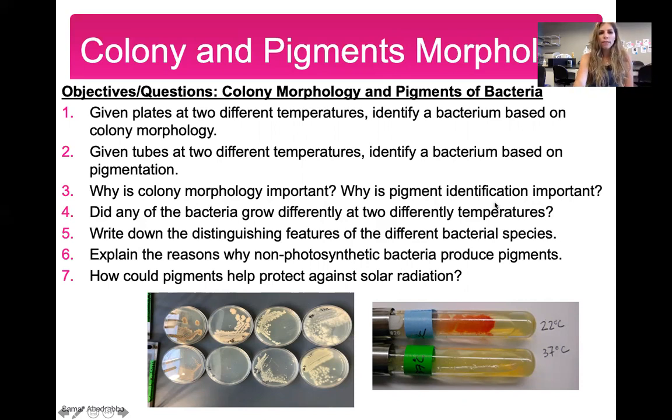So go through all of these and hopefully all of it makes sense. Know what the distinguishing features of all the bacteria we talked about are.